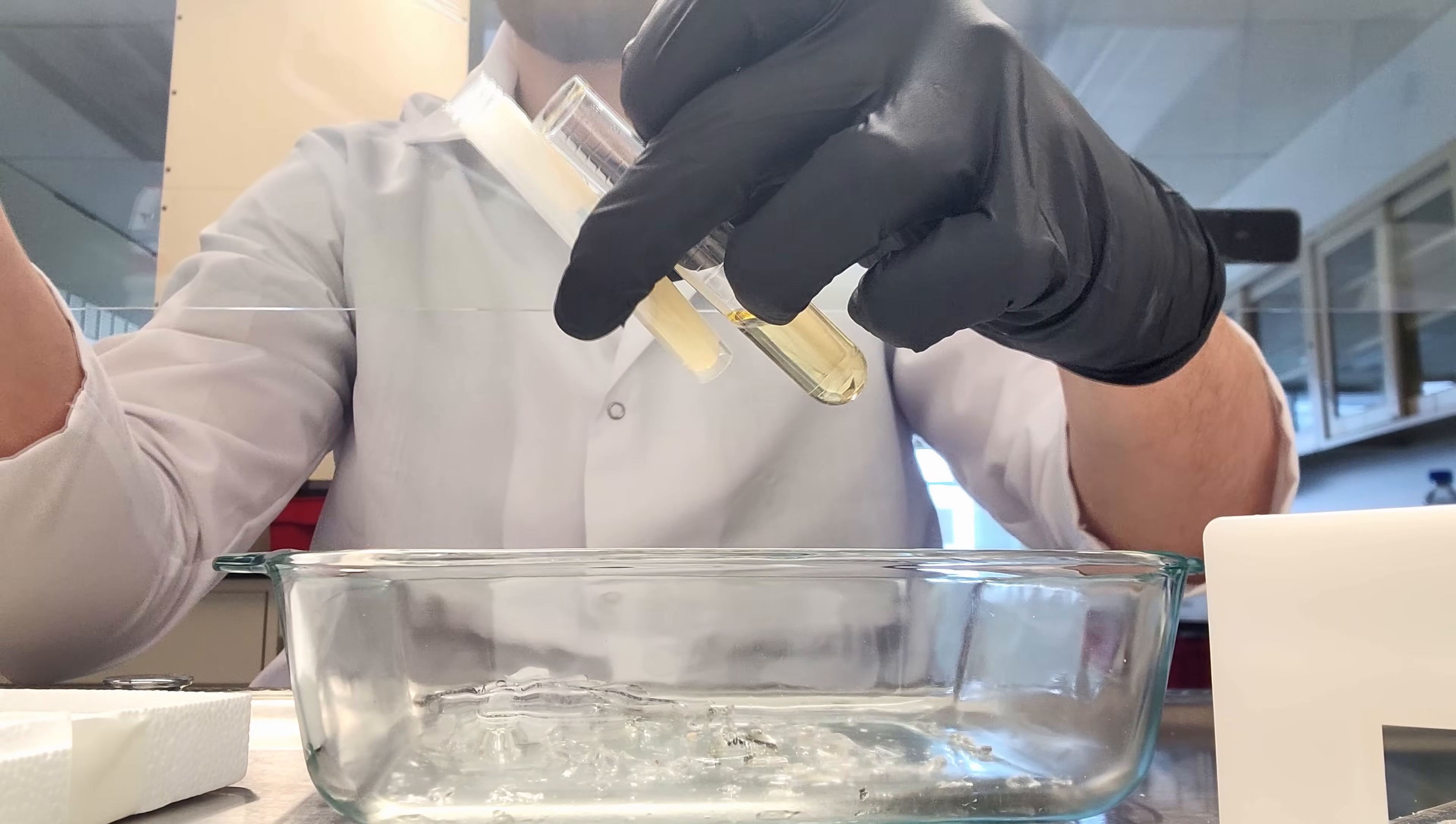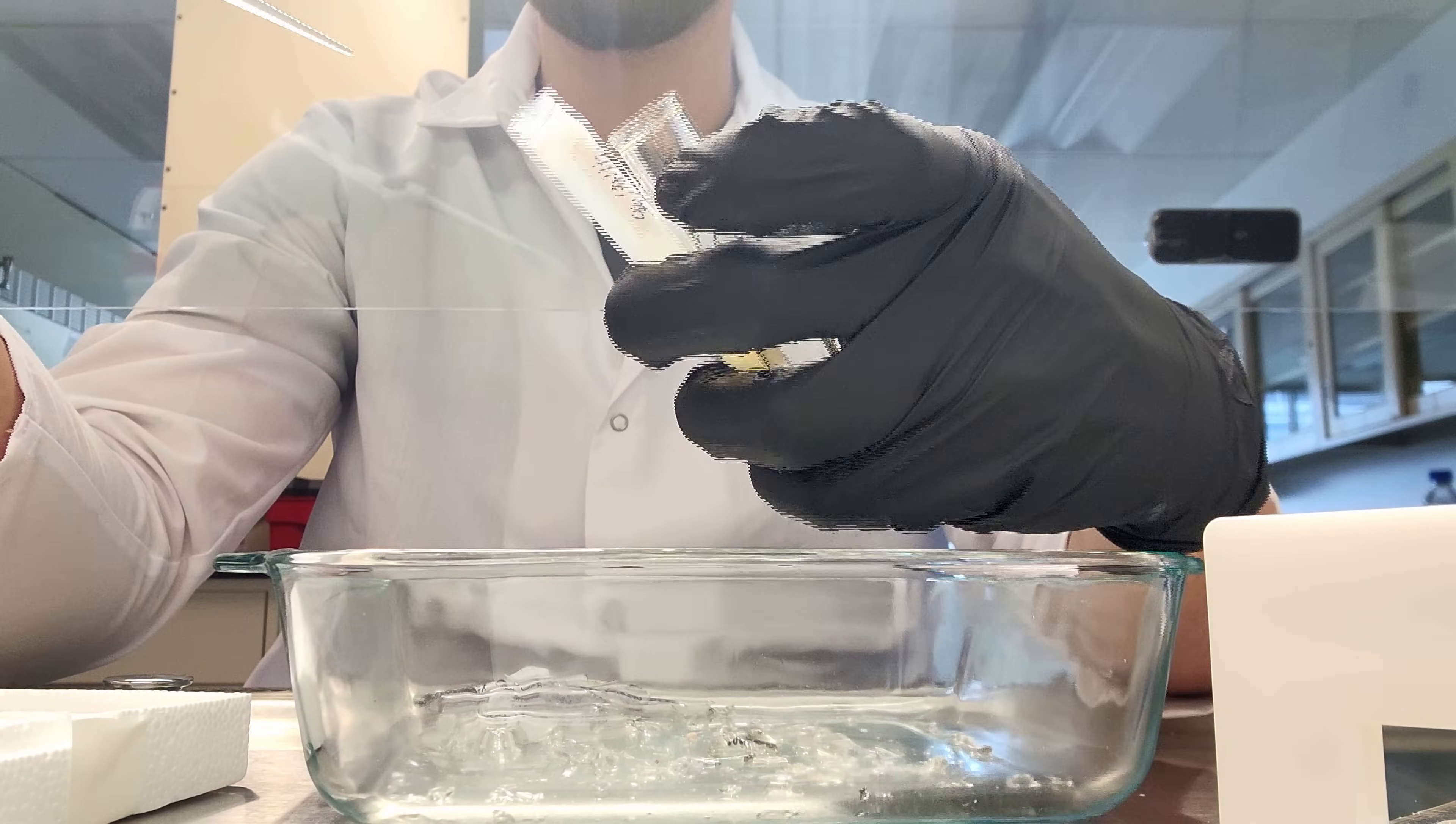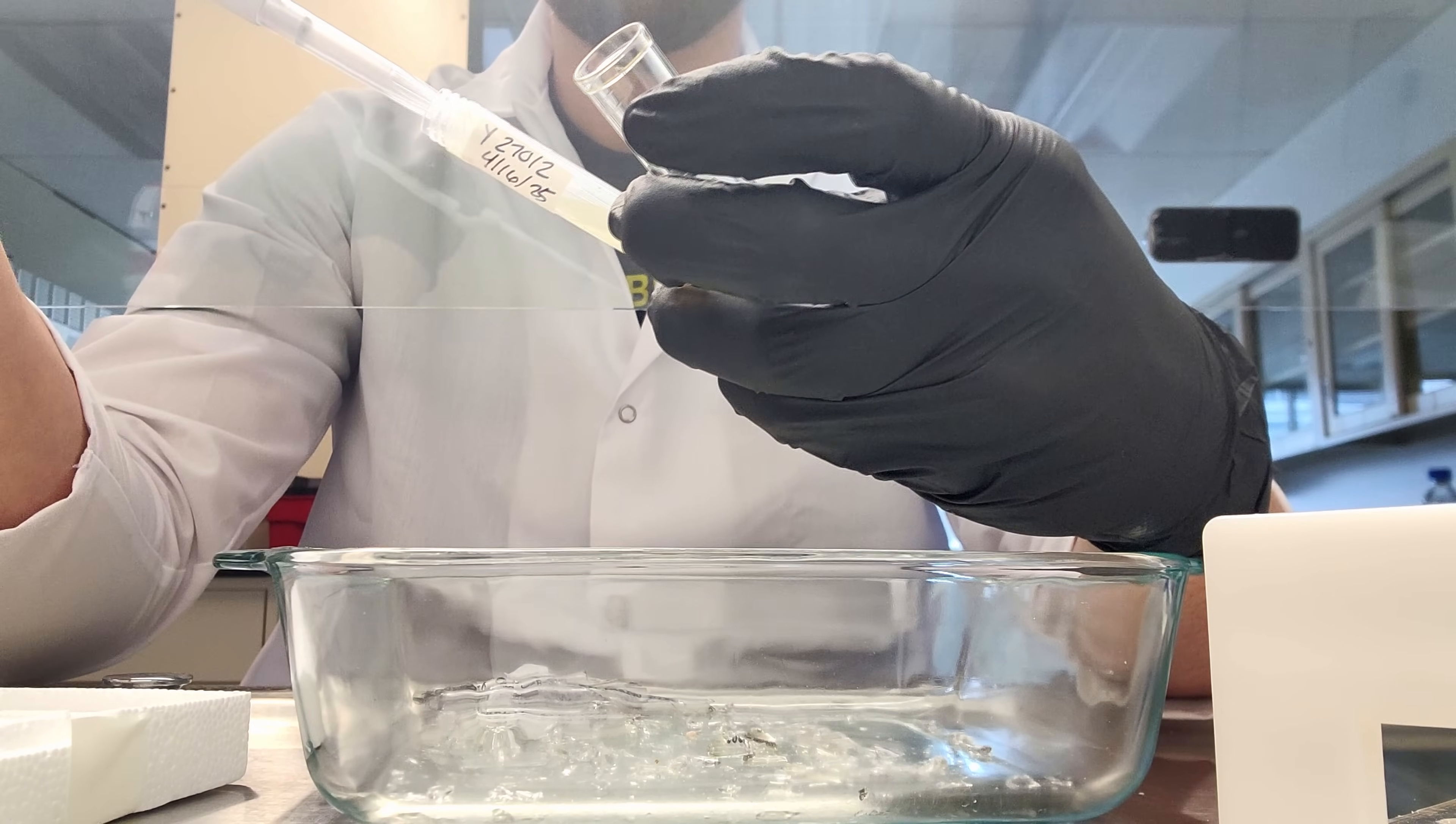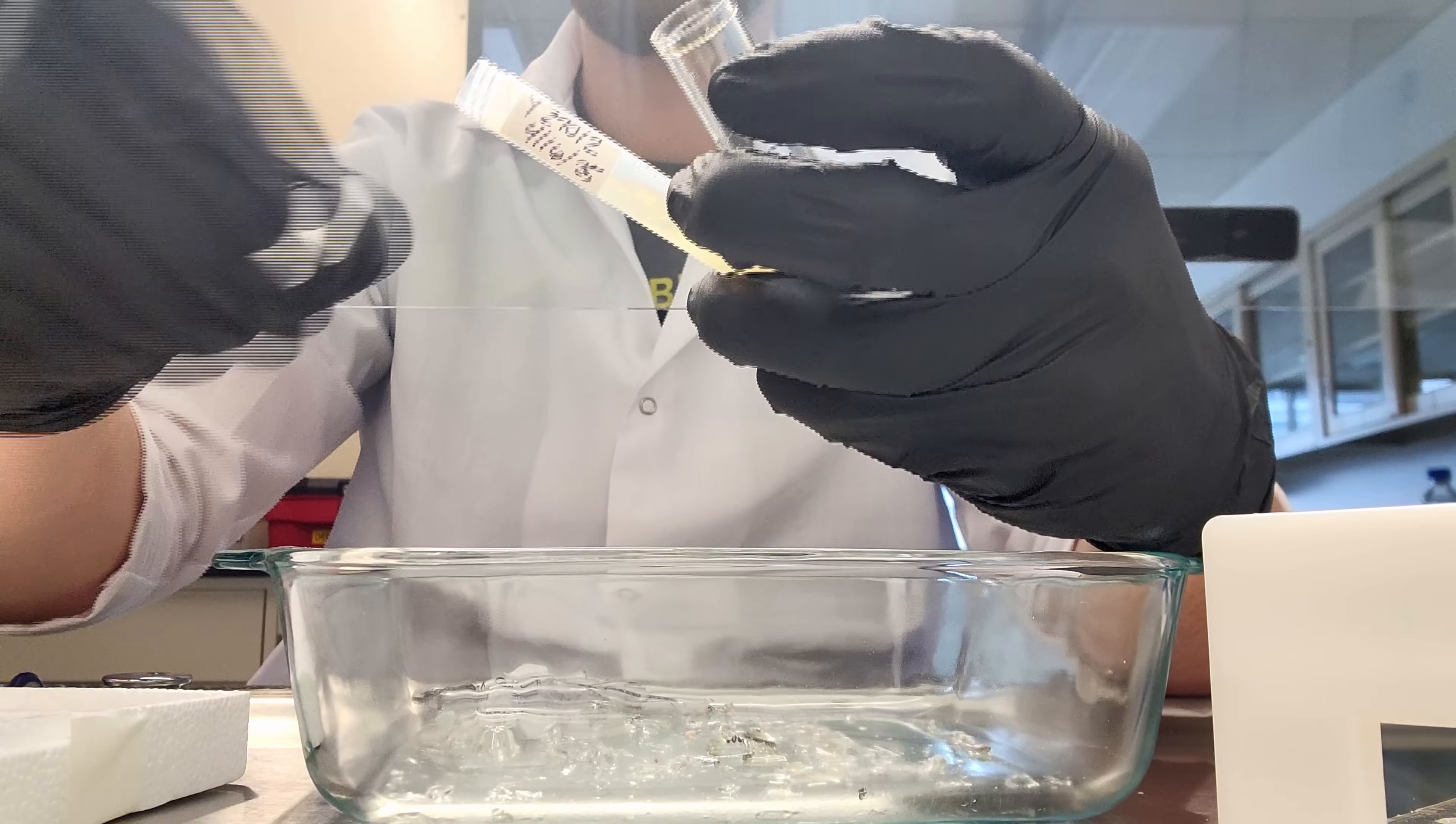In this case, to ensure I get enough cells off the surface of the agar, I'm actually adding the YPD liquid to the slant culture to resuspend the cells on the surface of the agar.